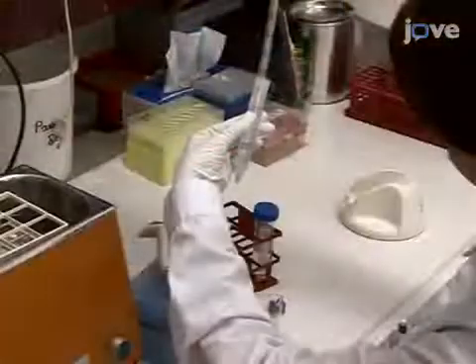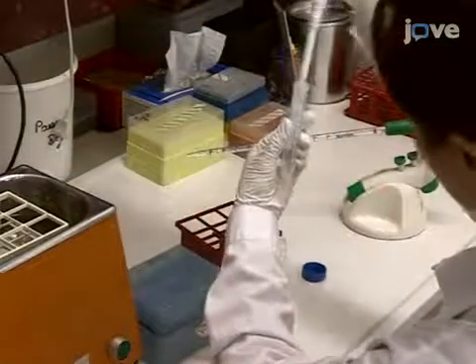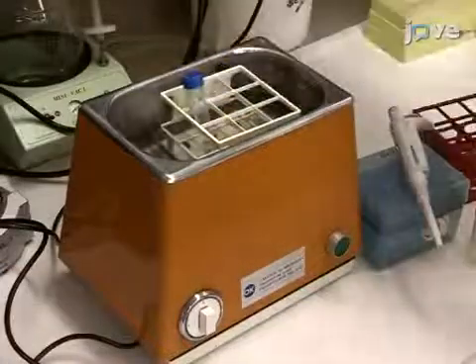After that, remove the supernatant and resuspend the zymosan in 1 milliliter of PBS. Sonicate it for 10 minutes in a water bath sonicator.